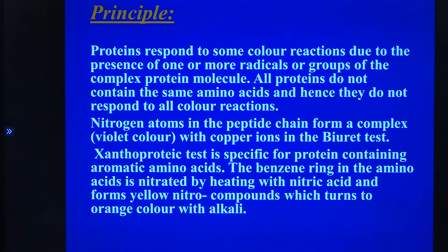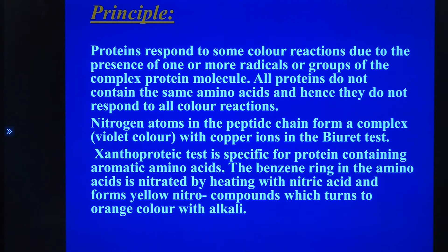There is also the xanthoproteic test, but we are not conducting that now. This xanthoproteic test is specific for proteins containing aromatic amino acids. The benzene ring in the amino acids is nitrated by heating with nitric acid and forms yellow nitro compounds, which turn to orange colour with an alkali.